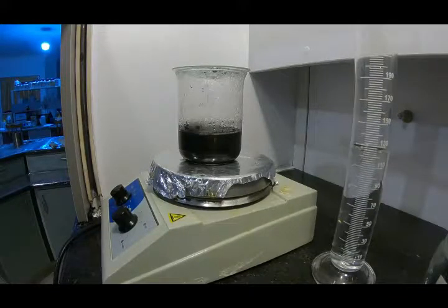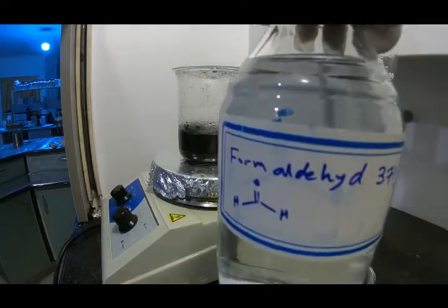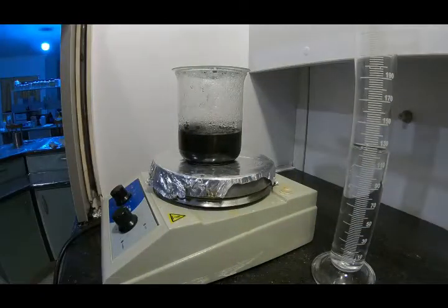Okay, for the next step we are going to add formaldehyde, about 1 milliliter, drop by drop to the solution, and then we are going to make it alkaline by adding 30% sodium hydroxide solution. So let's add the formaldehyde first.